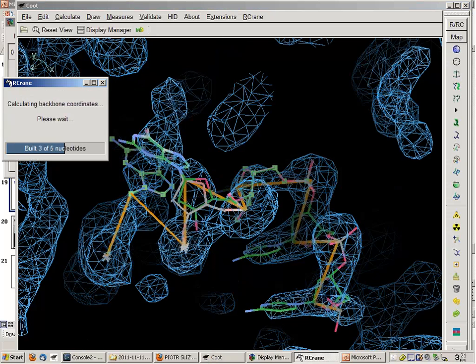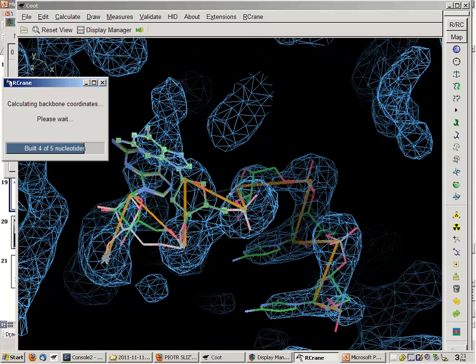But nothing should go floating off, and certainly nothing should get pulled out of density. This hopefully should just take another 30 seconds while it does its minimizing. I can tell you at least on my desktop, which is significantly faster, this whole process is done in maybe 5 to 10 seconds.